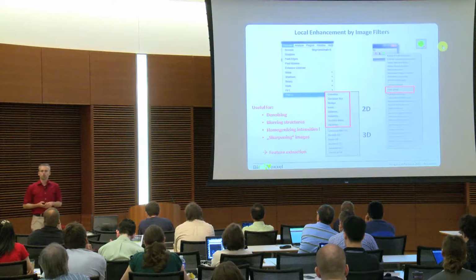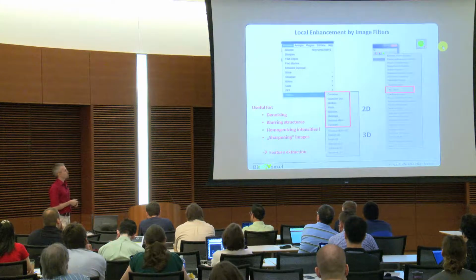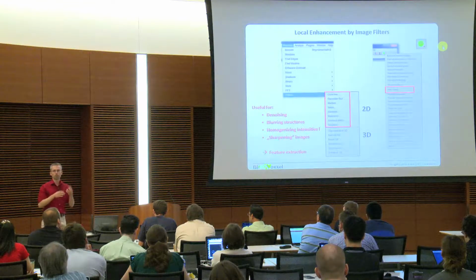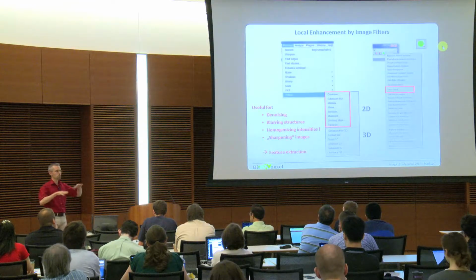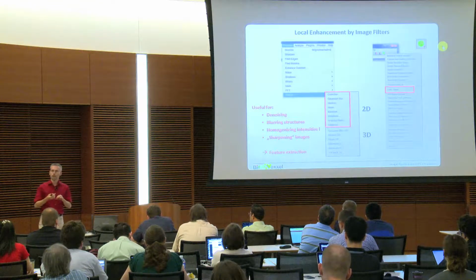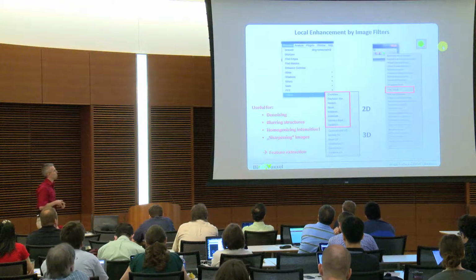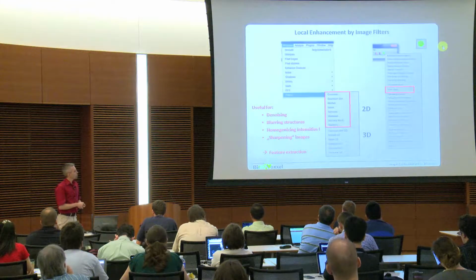Ari has shown this sharpen function. There is actually one for those kind of images which is slightly better. This is the unsharp mask here, because the sharpening function has the problem that it sharpens around every pixel, and if you have noise, it also pushes up the noise. The unsharp mask does not push up the noise too strong, because it specifically enhances around edges, so that has an advantage. So it's actually a good option to look at the unsharp masking in the manual, and also testing that on images. So we do that for feature extraction later on.